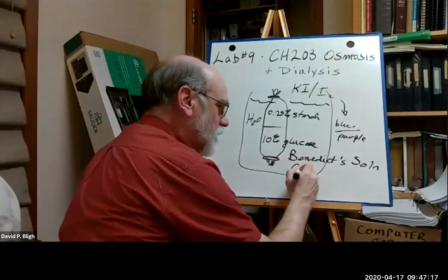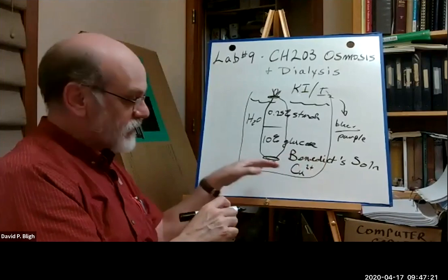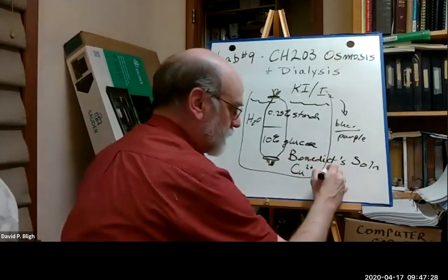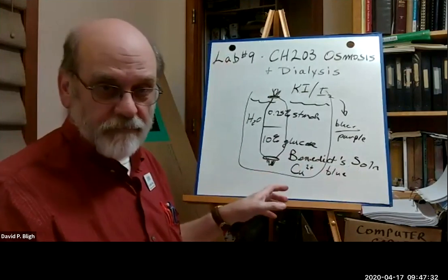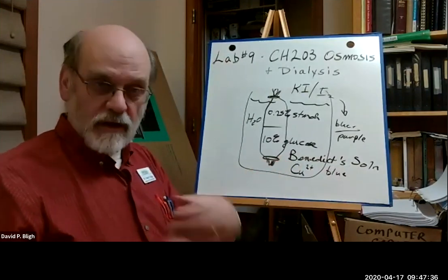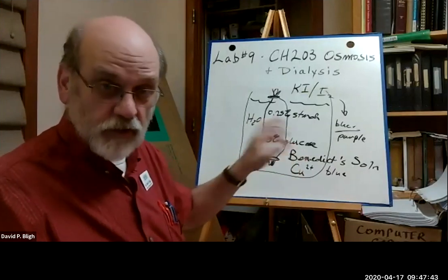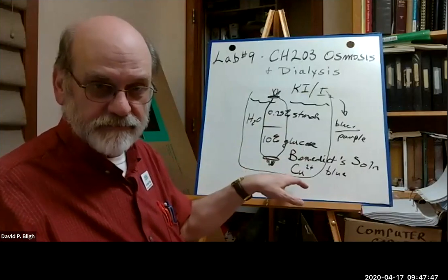So copper 2+ ion is in solution here, which means it's combined with water and is going to give you a blue color. Now, if there's any glucose in there, the reaction doesn't happen very fast at room temperature, so we need a boiling water bath. So when you develop this test in the solution looking for glucose, you have to put it in a hot water bath.